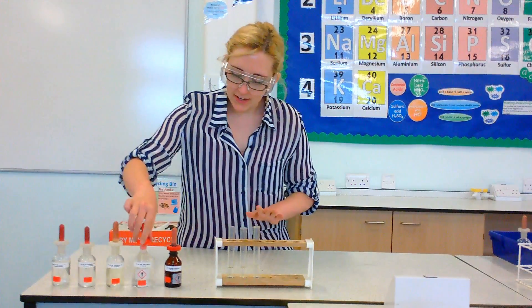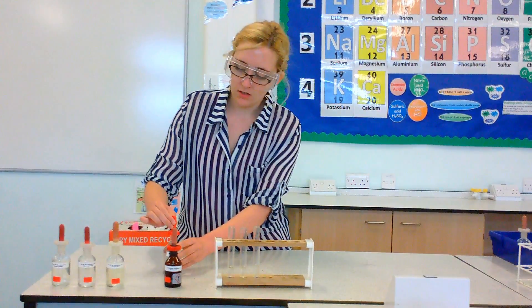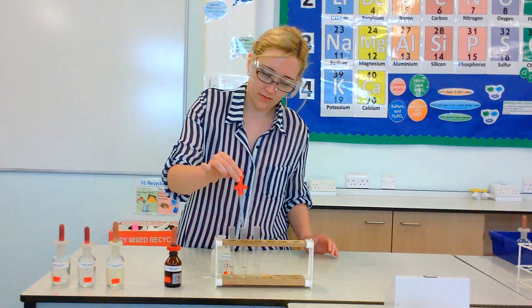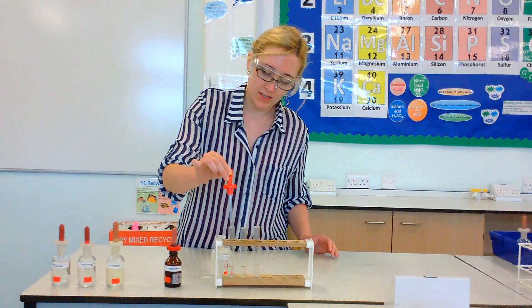Now what we're going to add next is some nitric acid. We don't need too much of this — just a couple of drops into each one. Just a little bit, there we go.